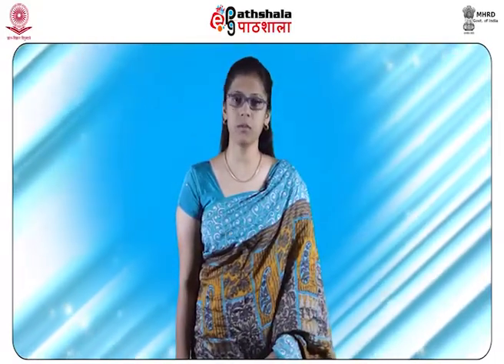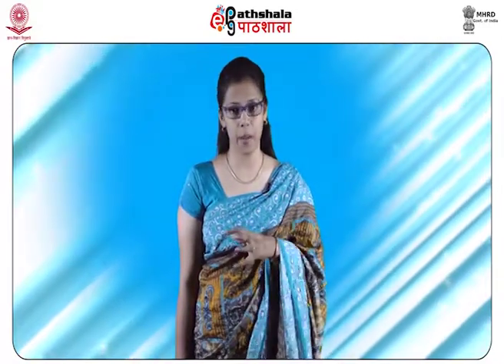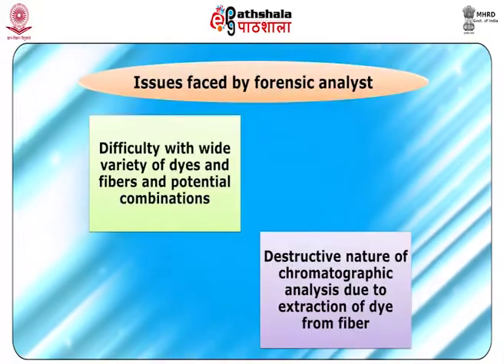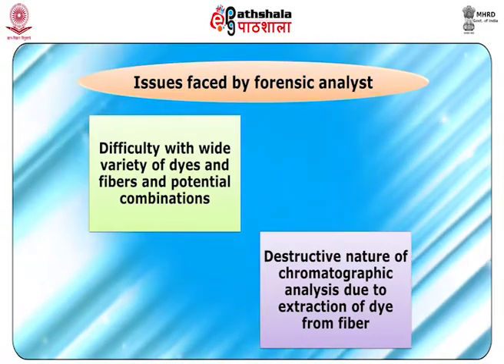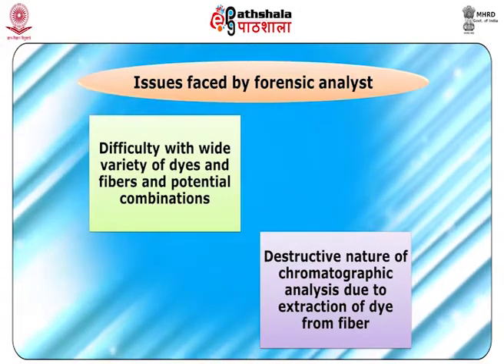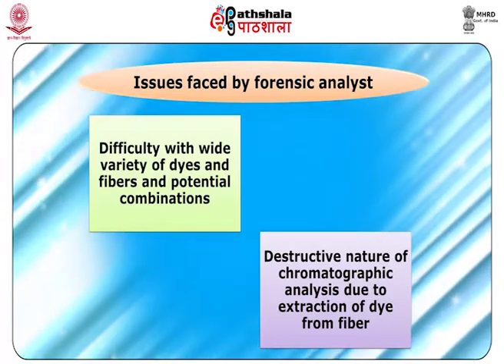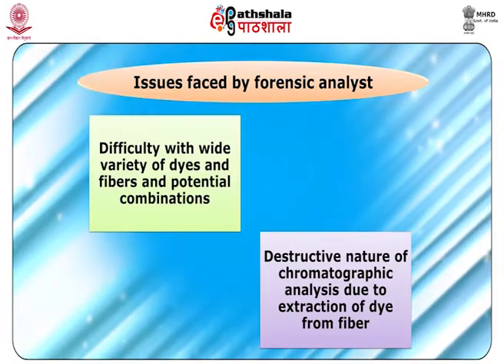Now let us learn about dye analysis. Forensic analysis of dye is usually carried out to compare a questioned sample with controls, to identify a particular dye. Two issues faced by a forensic analyst while analyzing fiber dyes are: first, the difficulty with the wide variety of dyes and fibers and potential combinations. Second, the destructive nature of chromatographic analysis due to the extraction of the dye from the fiber.